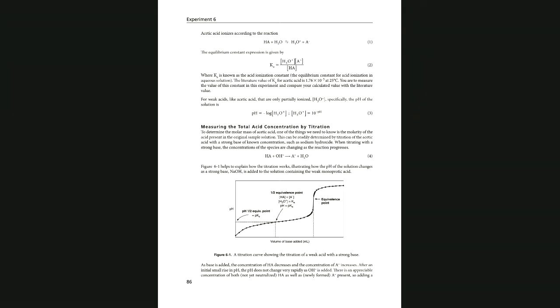So the purpose of the experiment: the methodology is the same, it's the titration. The device that you are using is the same, but the application is different. First of all, you are going to see the pH meter, the change in pH, and when you see those graphs in lecture, you understand what it means. You start with the acid, pH is low, keep adding base, the pH is going to increase, but you have a sharp point where it's changing from acidic solution to basic solution, and you have your equivalence point right there.